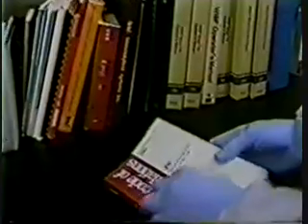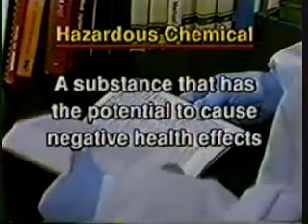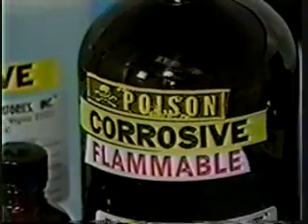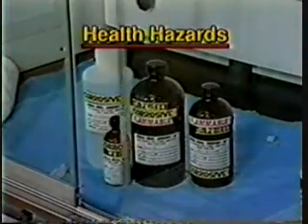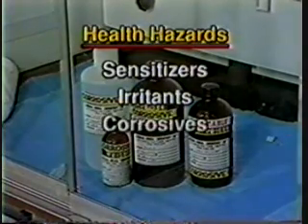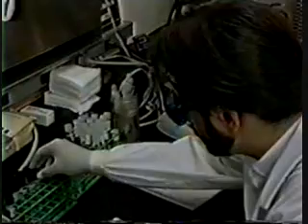For the purposes of the laboratory standard, a hazardous chemical is a substance that has the potential to cause negative health effects. The effect a chemical has on the body depends on the type of health hazard it presents. There are 5 basic categories: sensitizers, irritants, corrosives, toxic chemicals, and carcinogens.